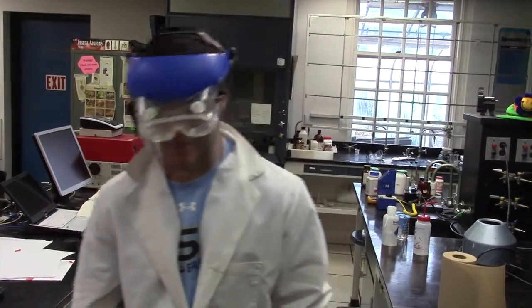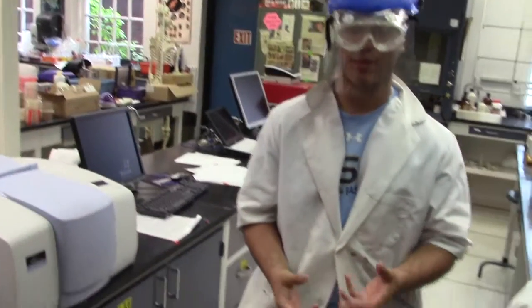Hey there, welcome back. Now sometimes in your experiments it's not always a liquid and you can't use the salt plates, so you have to make your own KBr salt plate to test your solid sample. Now to do this, you have to start by cleaning a mortar and pestle and 2 bolts and a nut.